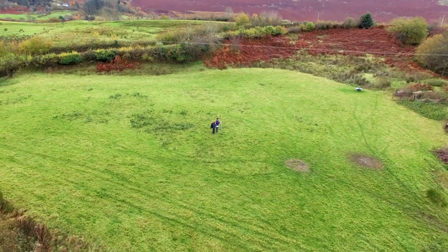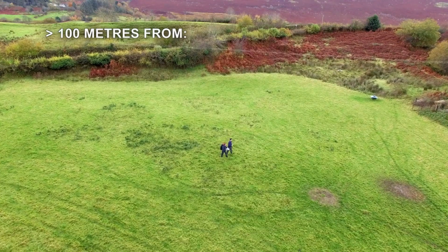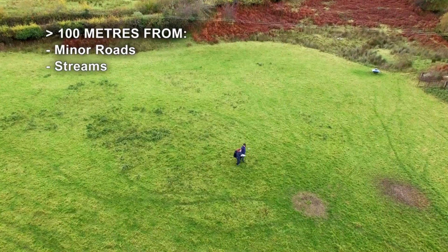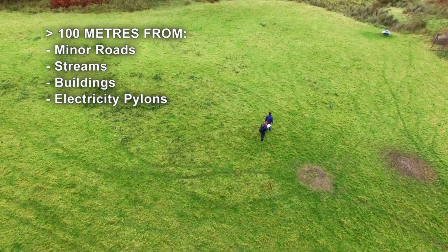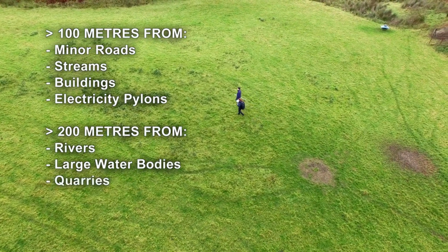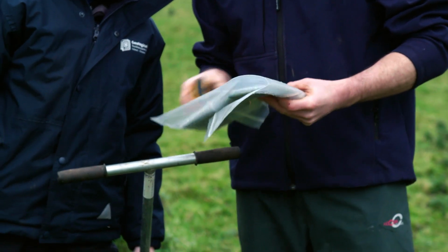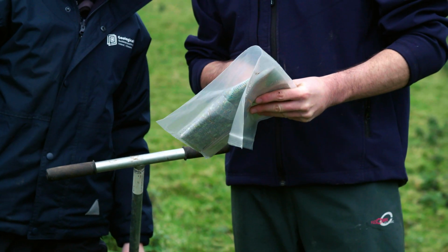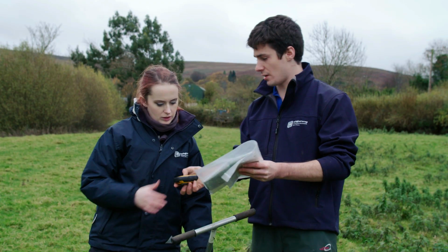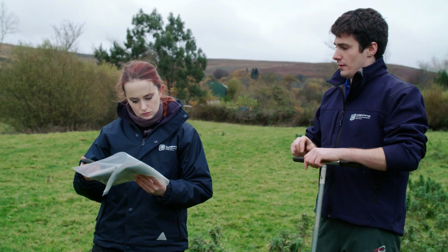The sample site must fulfill a number of distance criteria. For example, at least 100 meters away from any features that are present or are mapped, including minor roads, streams, buildings and electricity pylons, and at least 200 meters away from rivers, large water bodies, quarries, railway lines and major roads. At the chosen sample collection site, note the exact location using your handheld GPS unit. Both samplers should cross-check the location on the 1 to 50,000 scale field map and confirm that the site meets all criteria and is suitable.